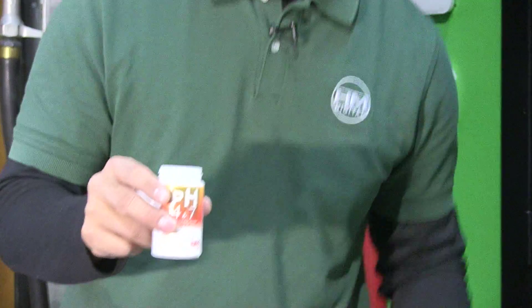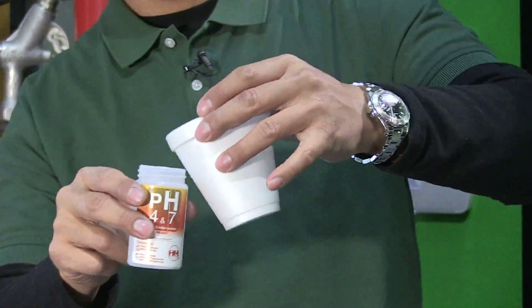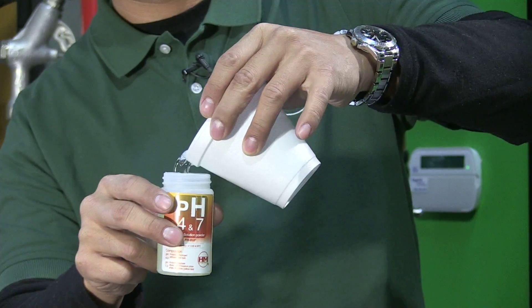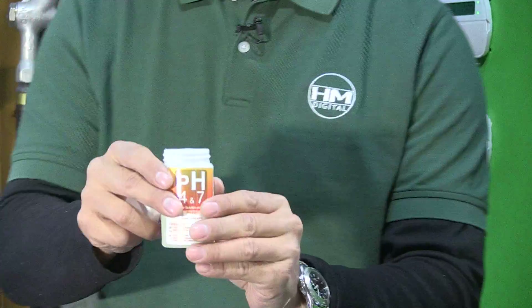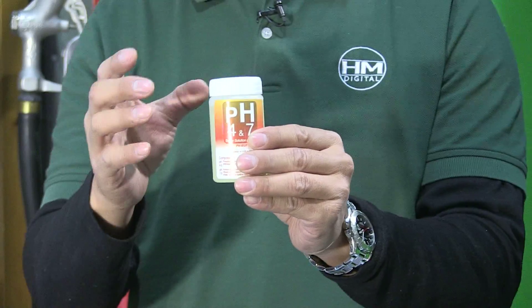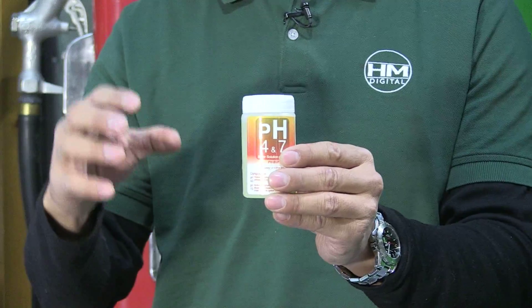Then take a little bit of either RO or distilled water and pour it into the bottle up until the fill line on the label. I'm asking you to mix it with RO or distilled water because that kind of water is much more aggressive to make sure your powder is fully dissolved.